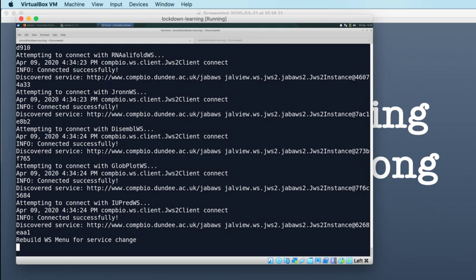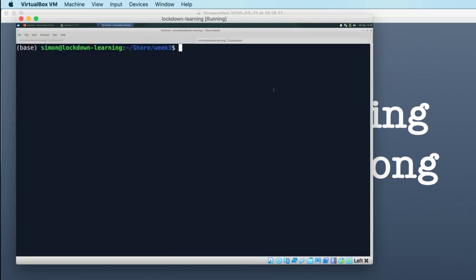It's just showing the output, the standard output and standard error that Jalview produces as we use it. So we can't run commands in this terminal at the moment until we close Jalview. So I've opened a new terminal. I did that in the file menu, and I picked open tab. So I've opened a new terminal in another tab in the same window. So that's my clean terminal.